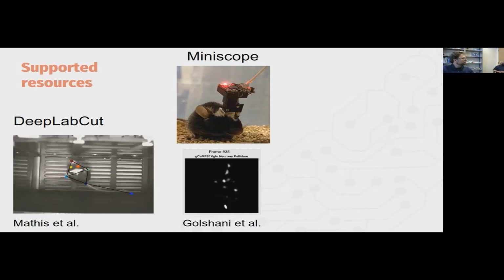Does that sound about right to you, Ryan? I think maybe 200 microns. Okay, less than a millimeter, maybe 200 microns or so. Yeah, it's possible that, oh, Andrew, okay, Andrew's already answered that. Good. There's a new scope V4 with 1 millimeter diameter field of view. Okay, so maybe that's the maximum.